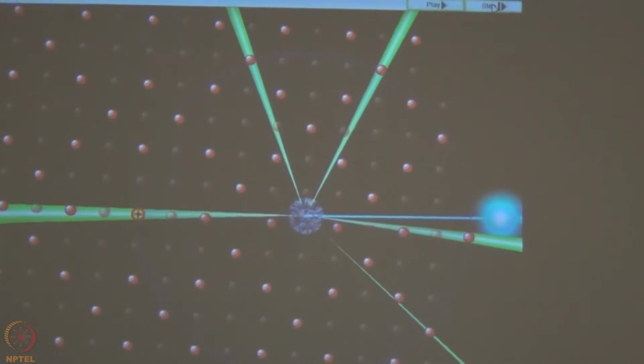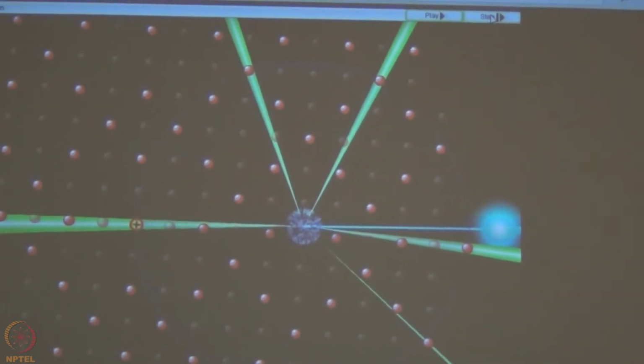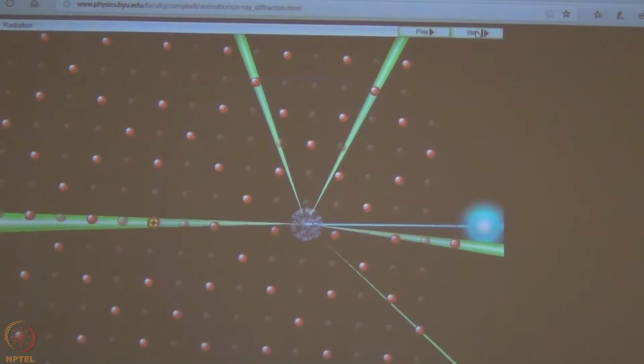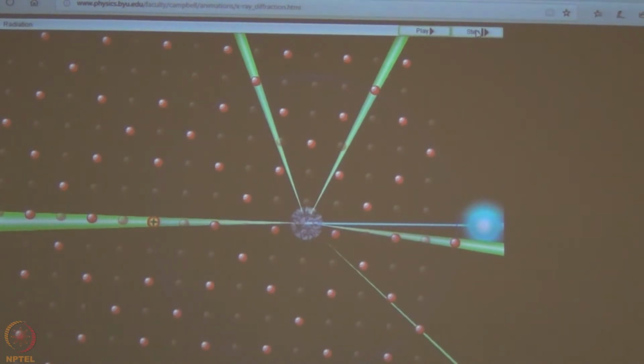So all the steps I have done are snapshots of the diffraction image of this crystal. I am rotating the crystal maybe every time by 0.1 degree or 0.2 degree or 0.3 degree. The reciprocal lattice point slowly moves in space. So at one point when it just touches the circumference of the sphere of radius 1 by lambda, it starts to diffract. It may take 3 or 4 frames of 0.3 degree width for that reflection to pass through the circumference.